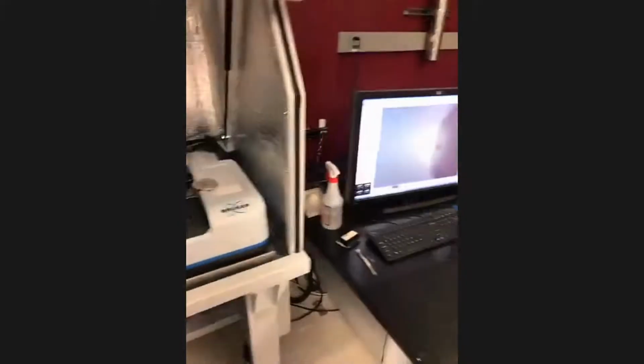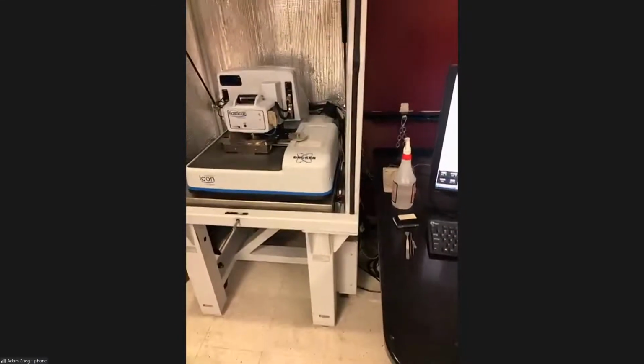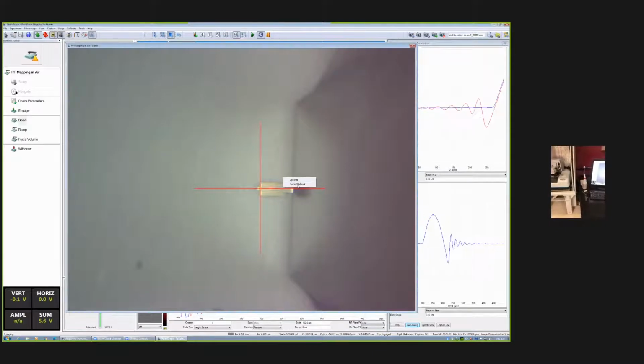And then once we get our tip onto the surface, maybe share the screen now, I can talk over it. Then you'll basically see that the tip is now going to be scanning on the surface. And what you're going to see now from the screen of the microscope is there's a little, looks like a paddle. Basically, that paddle is what we call our probe. It's a cantilever. It looks like a diving board, basically. But on the bottom side of that, underneath those crosshairs, is a very, very sharp tip, that little sharp needle that we had. And so that tip is now touching very, very delicately on the surface of a membrane that we're going to be measuring. And I think Mike is going to show you there.